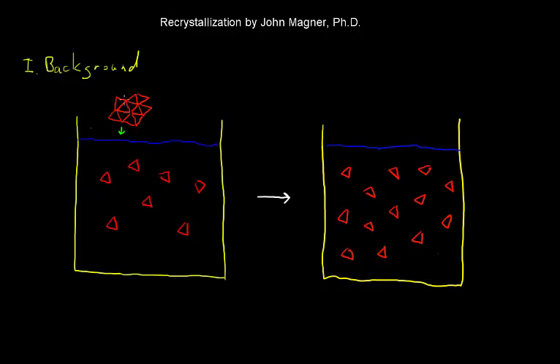And when we do that, of course, the solid crystal diffuses apart into individual molecules that are floating around surrounded by solvent molecules. So these are your solute molecules with these triangular shapes. Now, in most cases, if you were to continue to add more and more solid solute, this solution becomes more and more concentrated. You get more of these solute particles in solution. And remember, particles always attract each other. These solute particles attract each other either by van der Waals, by London dispersion forces, or dipole-dipole interactions, or hydrogen bonds, or some combination of those.